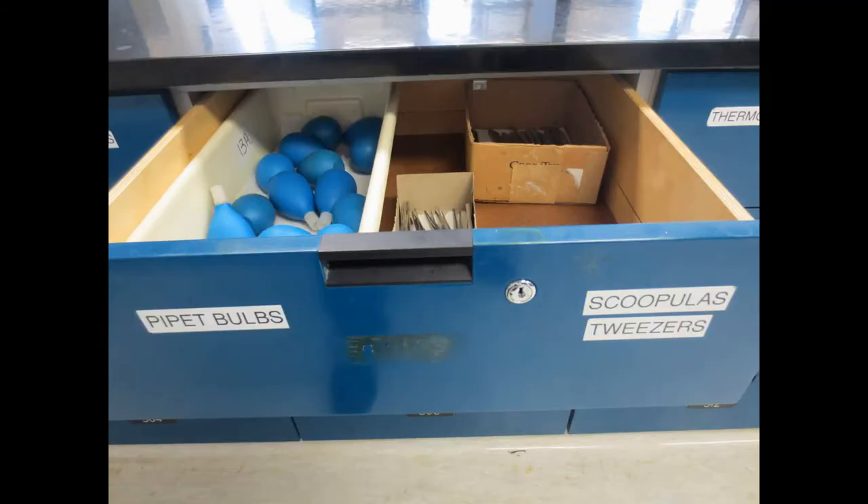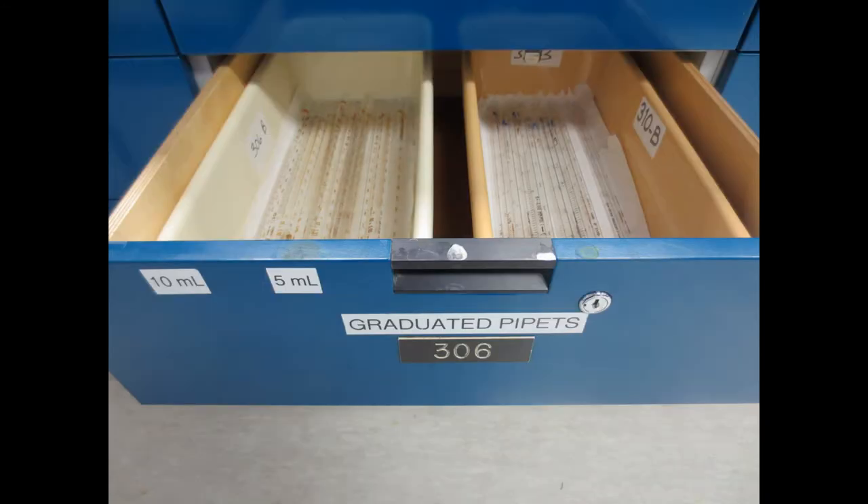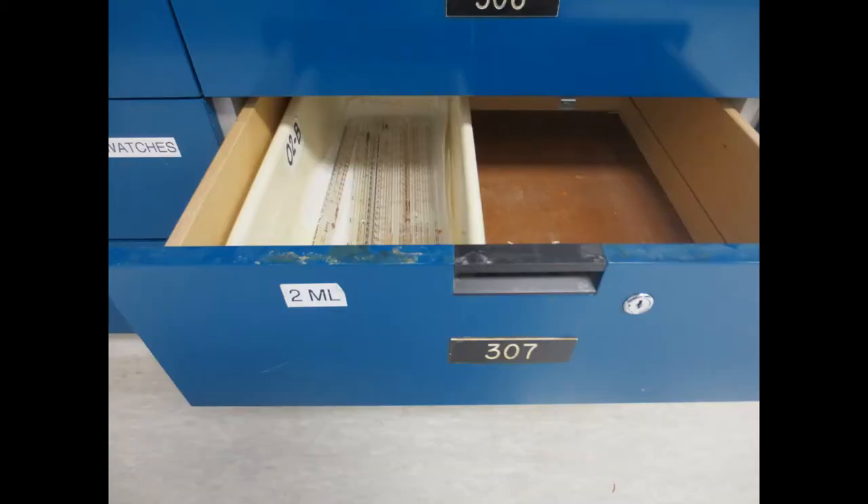Pipette bulbs, spatulas, and tweezers. Graduated pipettes, 5 and 10ml. Below these are 2ml graduated pipettes.